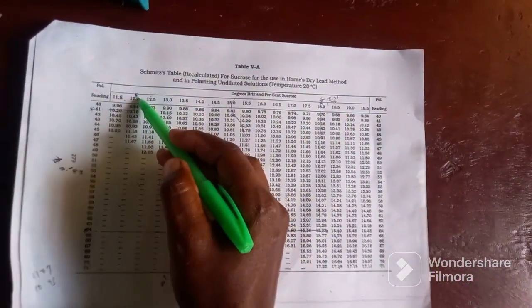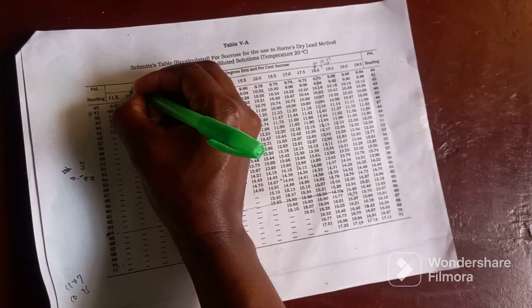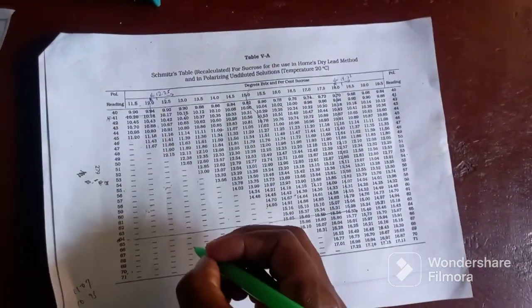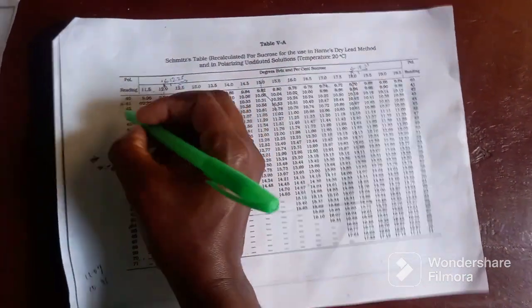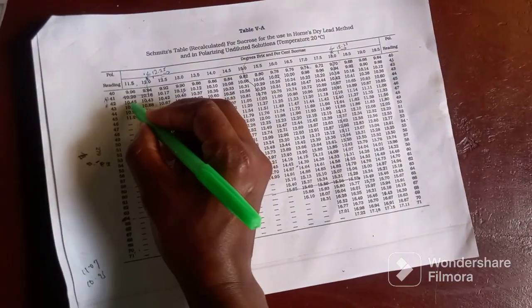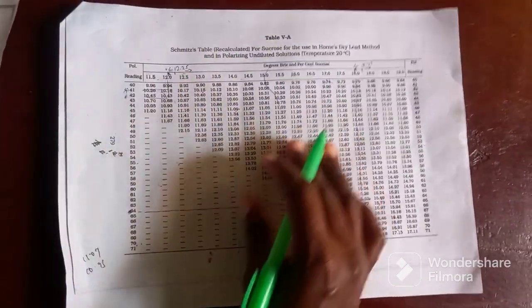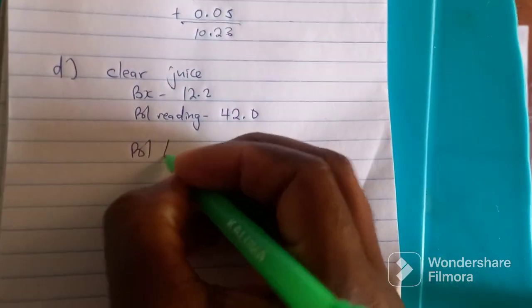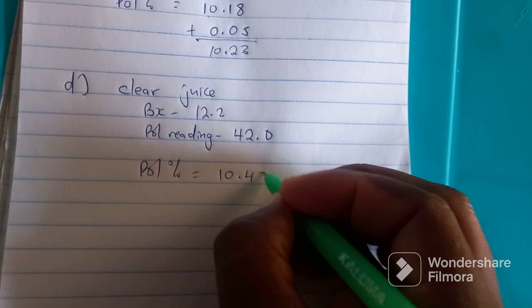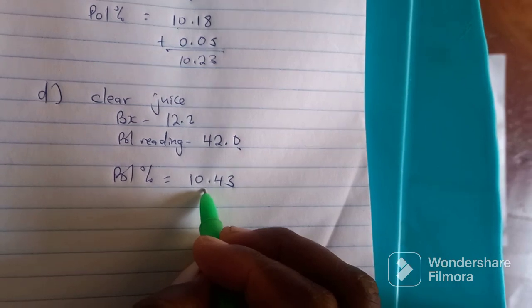So Brix is 12.2. Let's see where 12.2 lies. So it's between 12.0 and 12.5, and in between 12.0 and 12.5 is 12.25. So any number below 12.25 is read under 12.0. And I've said pol reading is 42, so pol reading is here, 42. So the value here between pol of 42 and Brix of 12.0 is 10.43. So we record that 10.43. And remember, pol reading was 42.0.